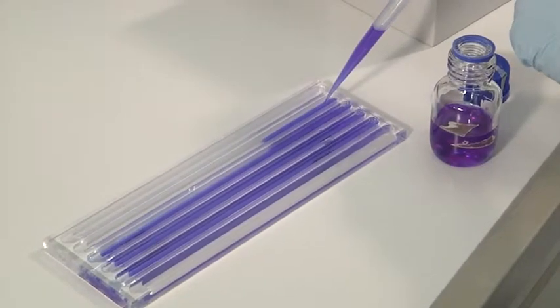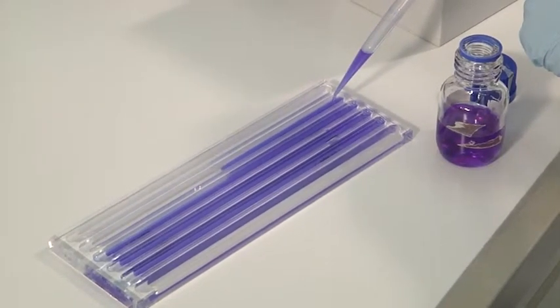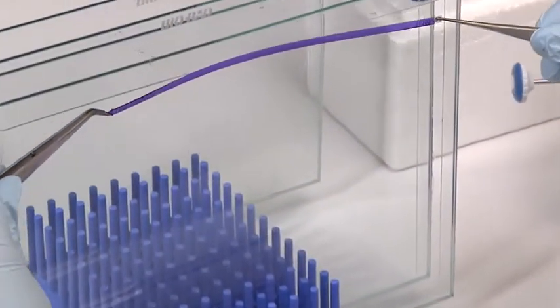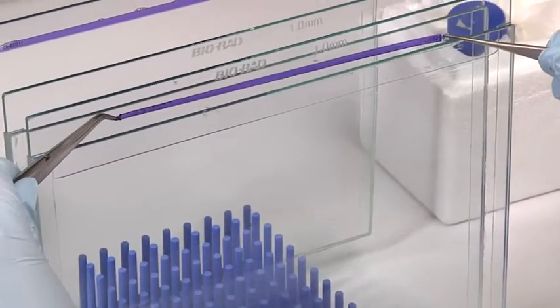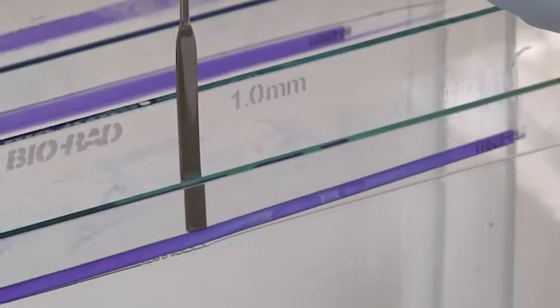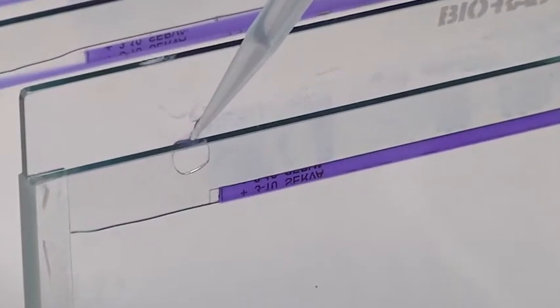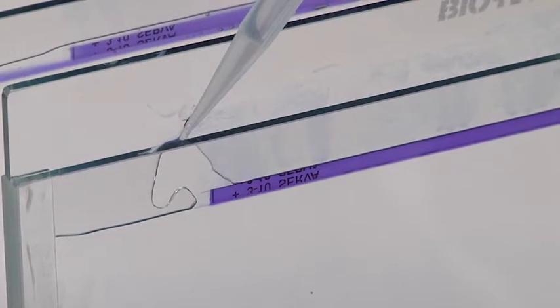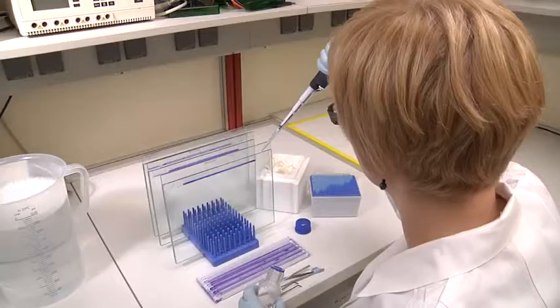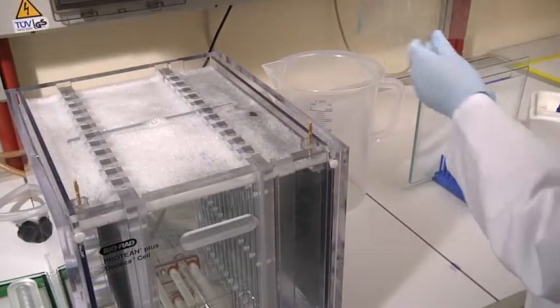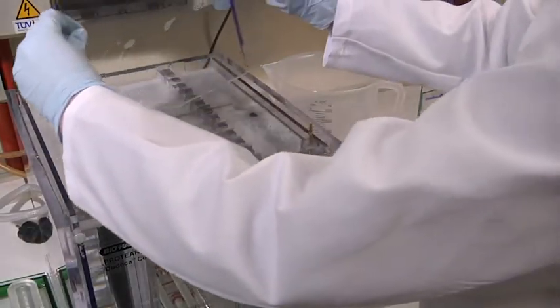As preparation for the second one-dimensional separation, the IPG strips are colored with bromophenol blue and applied onto an SDS gel. The strips are pushed into the gel and fixed between the glass plates. The SDS gel is then transferred into a gel electrophoretic chamber filled with buffer and the power is turned on.